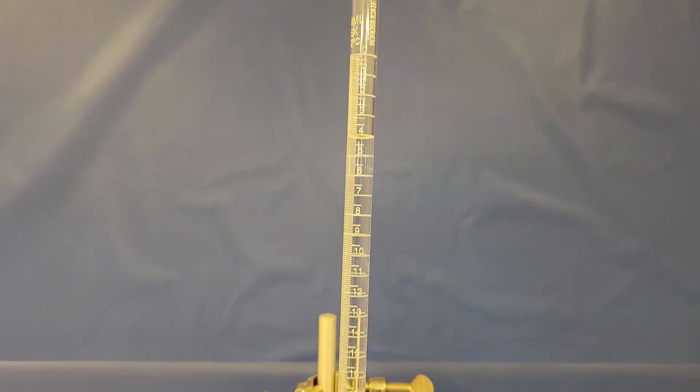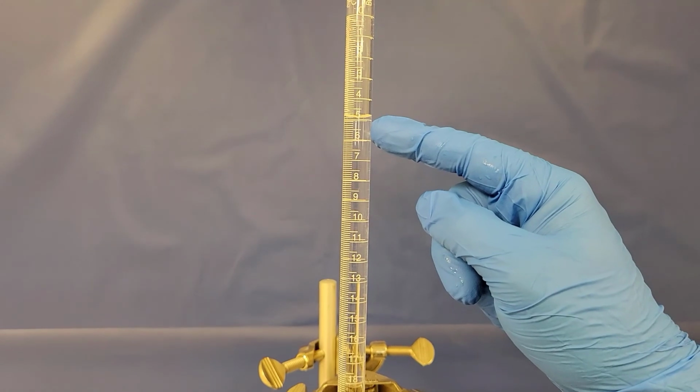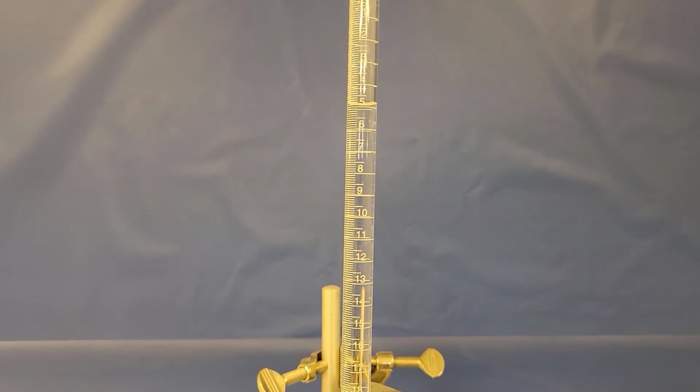As we get closer, I'll slow it down. Remember, when you're looking at this, you want to go to the bottom of the meniscus when you're reading, and the meniscus is that kind of U shape there. You want to go to the bottom, so we've got that right about at 5.